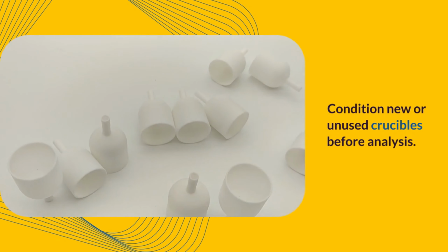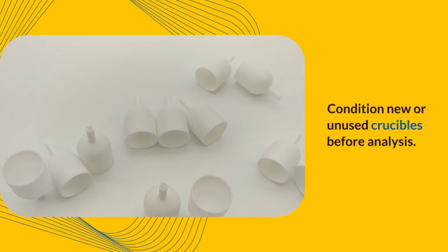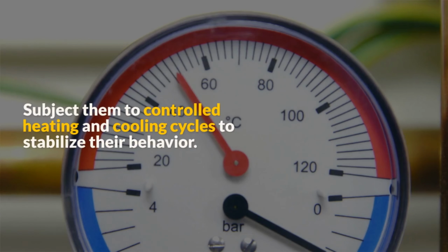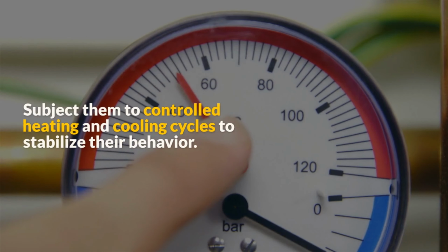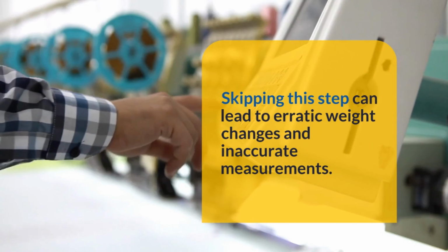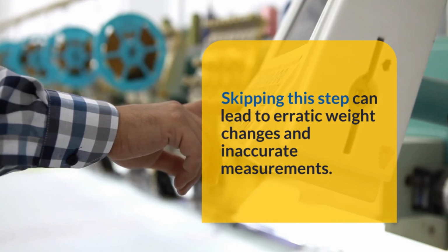New crucibles or those that haven't been used for a while should be conditioned before analysis. This involves subjecting the crucible to a series of controlled heating and cooling cycles to stabilize its behavior. Skipping this step can lead to erratic weight changes and inaccurate measurements.